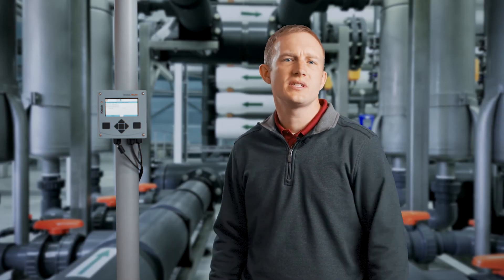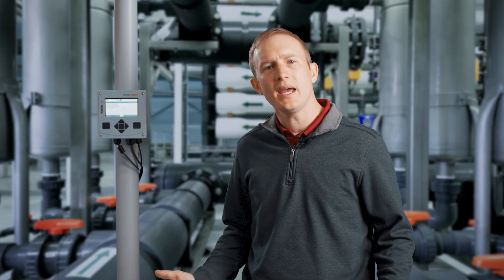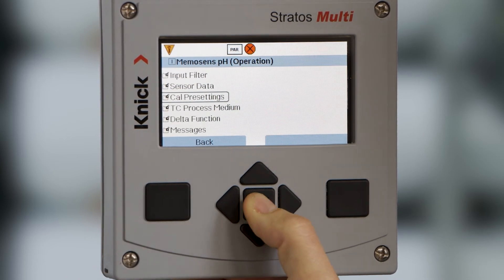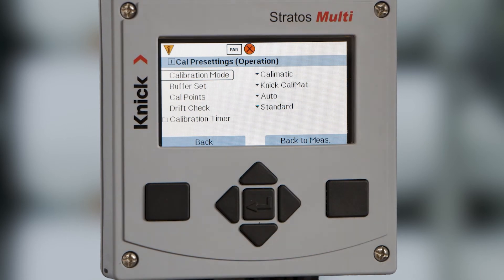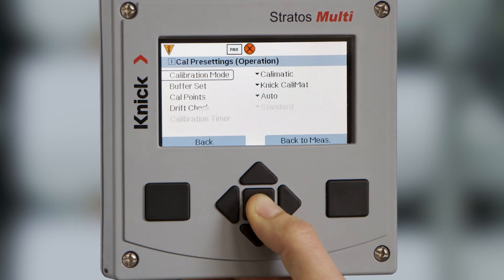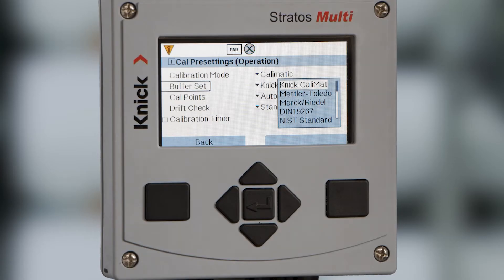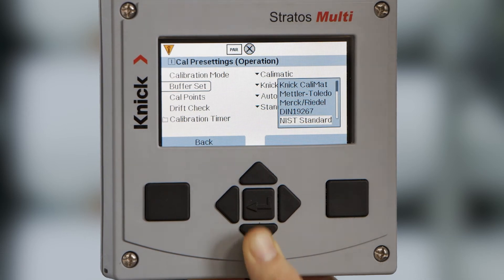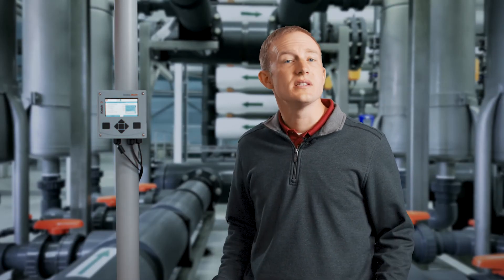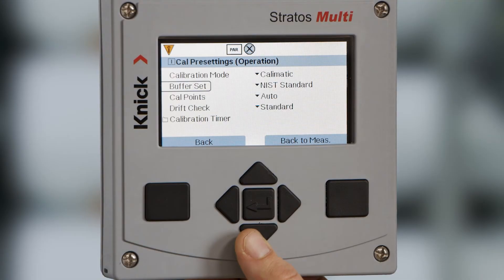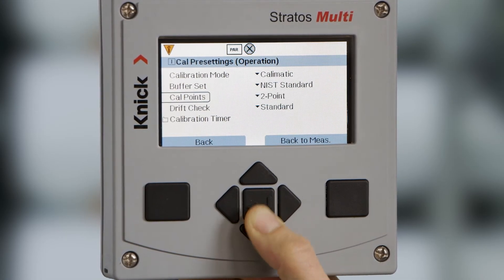Lastly, we want to ensure the calibration settings are set up for both our MemoSense pH and conductivity sensors. To do this, we will first set up our pH calibration settings by selecting channel 1, MemoSense pH, and parameter settings. Here, we will scroll to Cal presettings and press enter. We recommend Calmatic, or automatic calibration, which provides buffer recognition and temperature compensation automatically. Once you have selected Calmatic under calibration mode, it then offers us the ability to select which buffer set we are using. The most common buffer set on the market is NIST Technical. You can verify the buffers you are using by the labeling on your bottles. Next, we have the ability to select our default number of calibration points, followed by the drift check of the sensor.